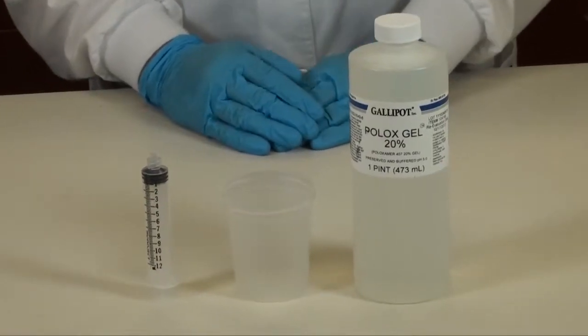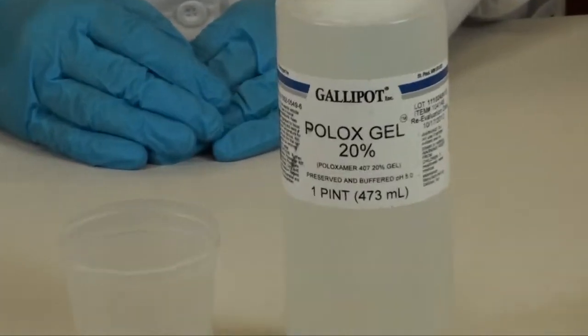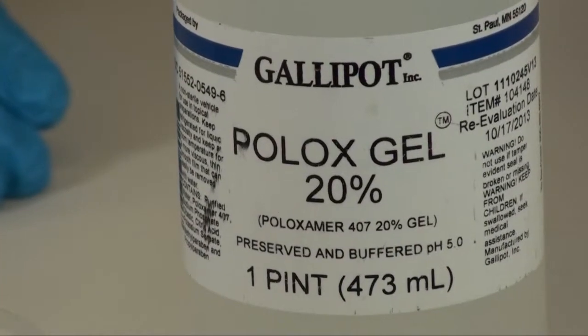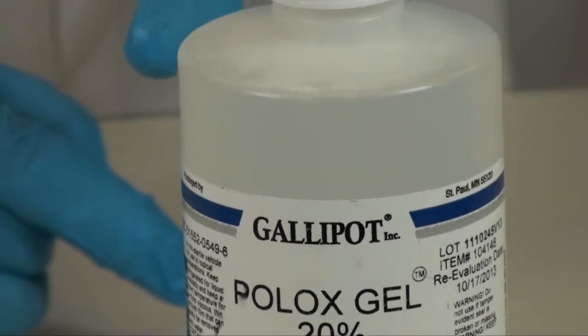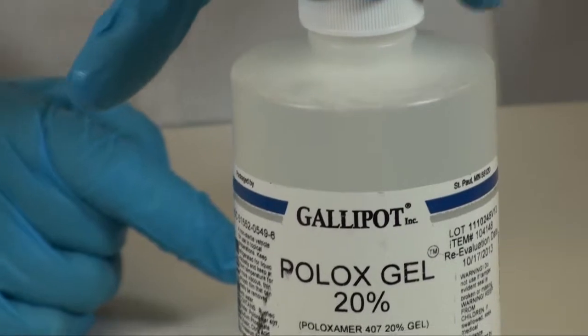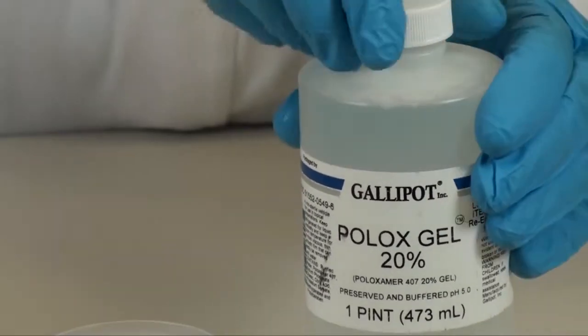In this step we're going to measure the required amount of poloxamer 20% solution. It is stored in the refrigerator. At this temperature it is in solution form. As it warms to room temperature it will turn into a gel.